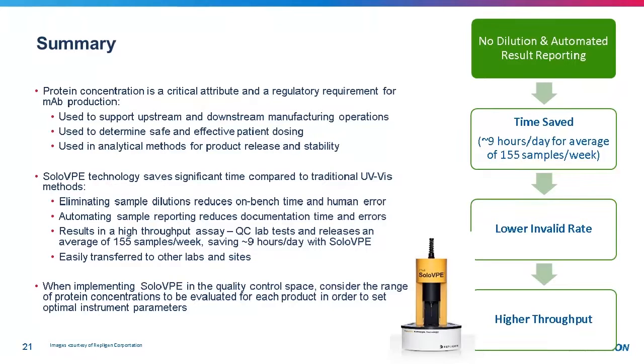Overall, as a final note, when implementing the SoloVPE, especially in the quality control space, it's important to consider the range of protein concentrations that will be evaluated and tested for each product. This ensures that we implement optimal instrument parameters right off the bat.